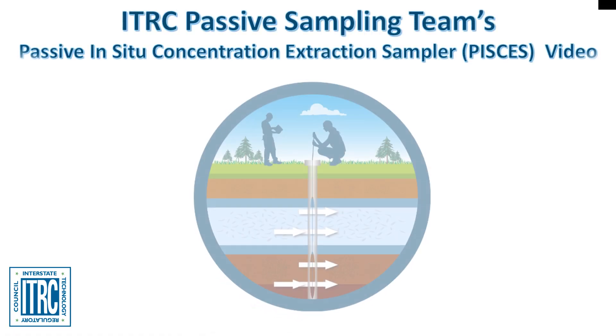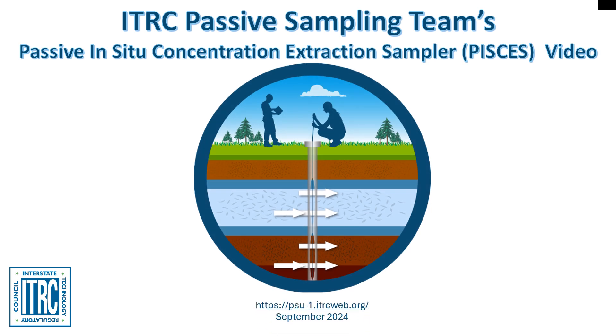The Passive Sampling Technology Update Team is proud to present an overview of the Passive In-Situ Concentration Extraction Sampler. This quick video will provide a high-level overview of the device, as well as instructions on how to use, deploy, and retrieve the device. For more information on this and other passive sampling technologies, please visit the Passive Sampling Technology Update Guidance Document.